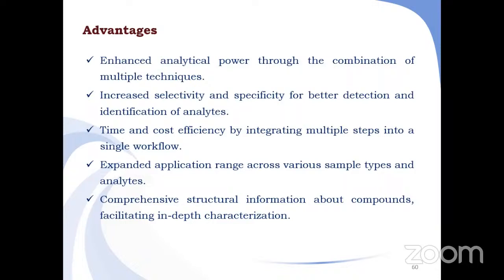in the sample. Mass spectrometry employs various ionization methods, determining the masses of the molecule by measuring the mass to charge ratio of its ion. This creates a high vacuum environment, with consideration of specific factors.